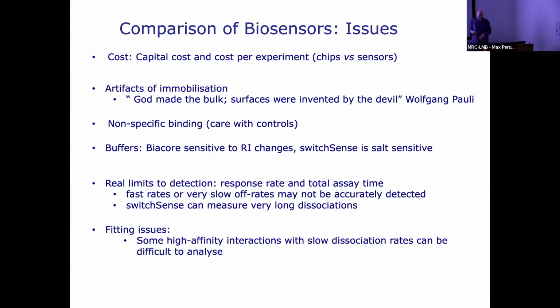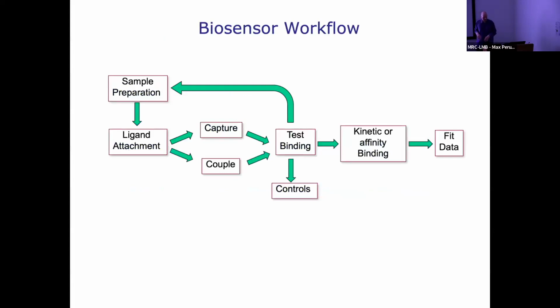And with everything, as we'll come on to later, some high affinity interactions where you've got a very, very slow dissociation will be very, very tricky to fit, but we'll see ways around that. Okay, so let's think about what we have to think about when we do experiments.